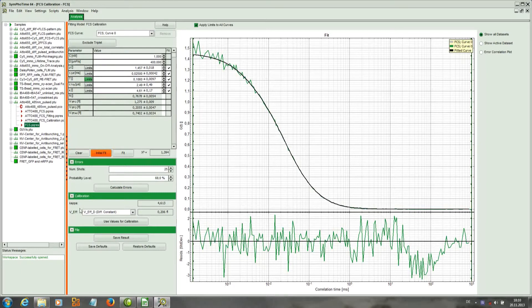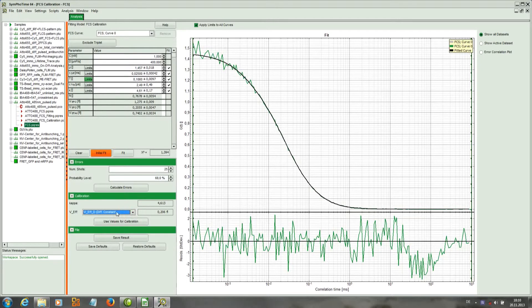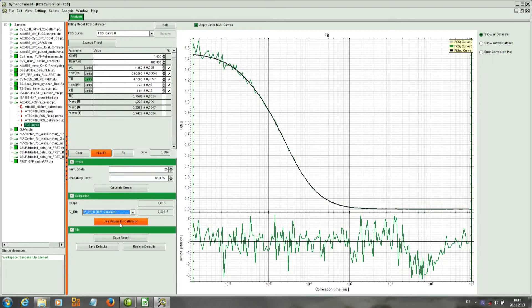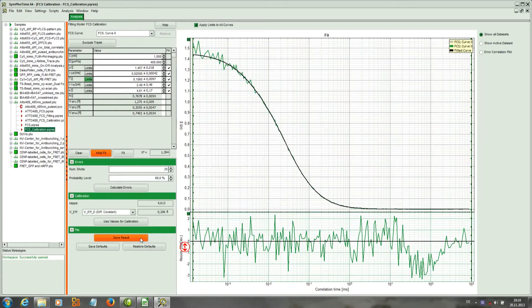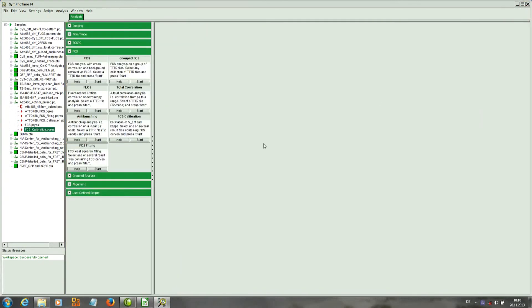Which one we want to use we can select here. In our case we want to use the volume calculated from the diffusion constant. We click on 'Set use values for calibration' and this volume is set as the effective calibration volume. We save this result, create a new file, and can close this window.